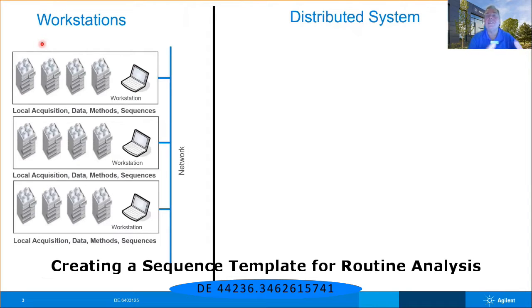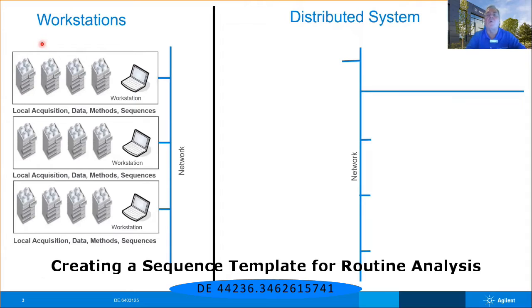They are designed to be islands, silos of information, and islands were not necessarily designed to duplicate each other. So there is not an easy way of being able to do that. But let's say instead we take this same type of idea and we now start to leverage a little bit more of our network inside of our laboratories.